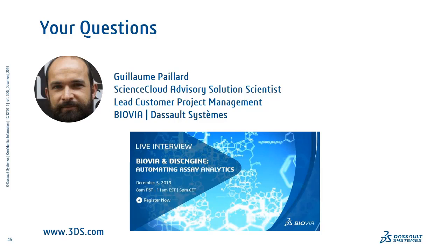Some of the questions that came in, I'll start off. The first one: I am using R statistics to perform some of my screening analysis. Can that be used in Assay?